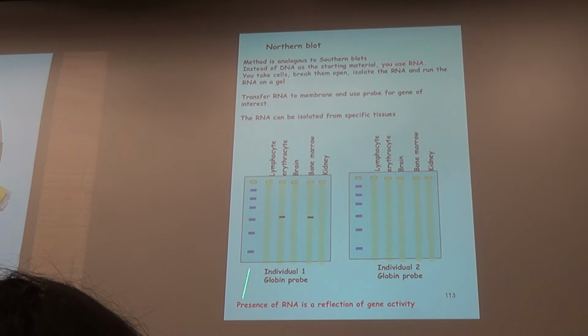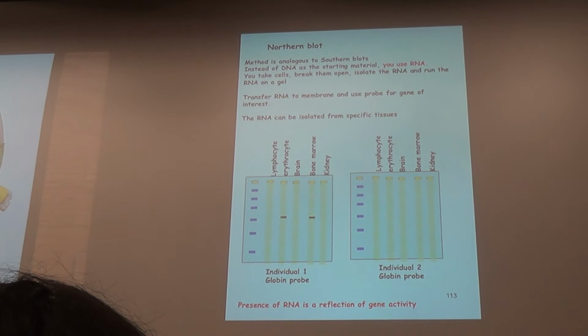I will do the same analysis, isolate RNA, or take the same RNA from these individuals and probe it with a probe for the histone genes, or another gene that's interesting to you, it's up to you. So you can do it individually, you can run one probe after another probe after a third probe, one after the other. Set up a system. Every day you run one probe. After 30,000 days, you will have a picture of all 30,000 genes in the human genome.